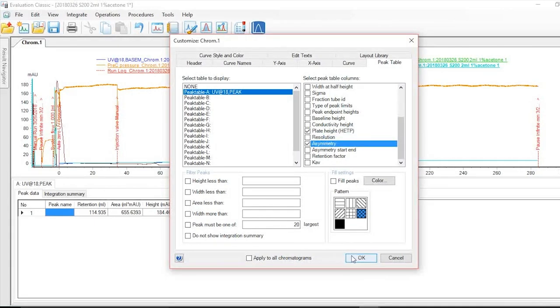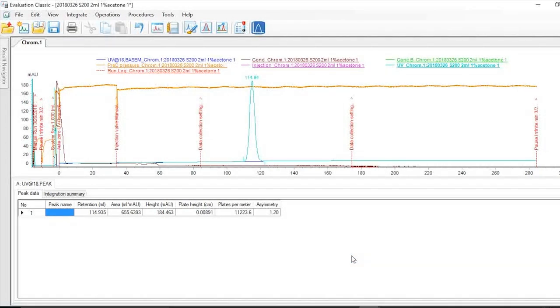The qualified HETP needs to meet the requirements described in the user manual, and asymmetry needs to be between 0.8 and 1.5. Based on these requirements, performance test of this column is passed, and column packing has been successfully performed.